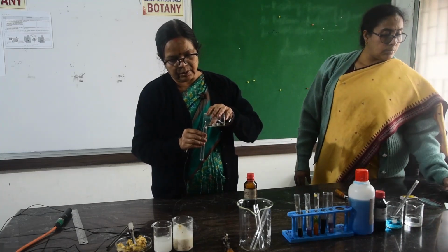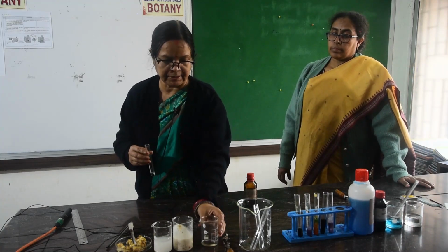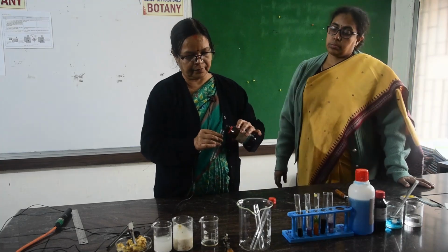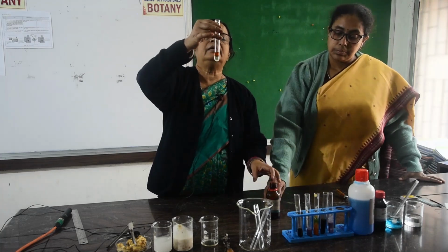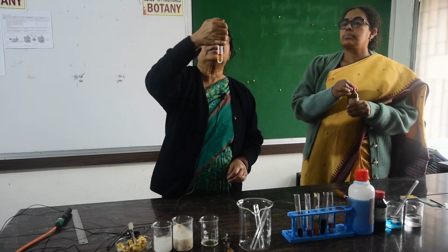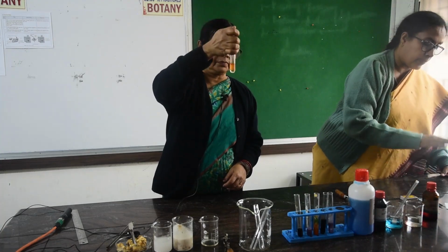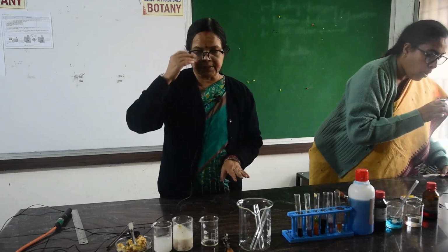I have taken sunflower oil and added 2 to 3 drops of Sudan III. Look, this type of color will form. The pink color bubble formation indicates the presence of fat. So all these are tests for food sources. That's all. Thank you.